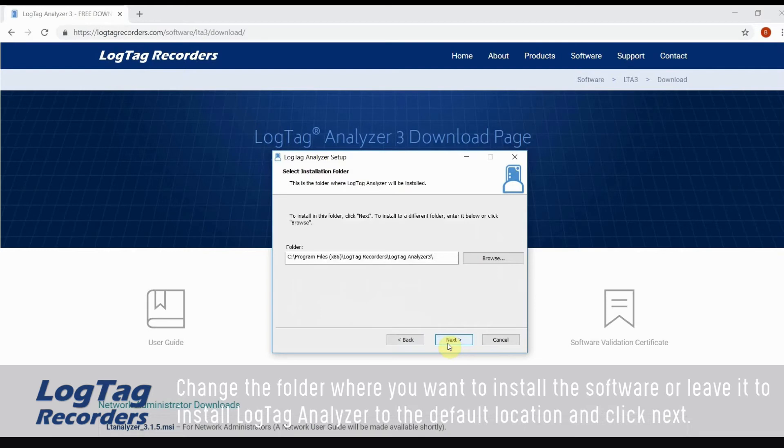Change the folder where you want to install the software or leave it to install LogTag Analyzer to the default location and click next.